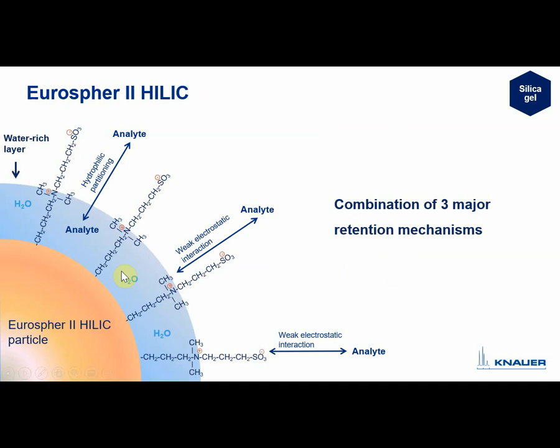Here you have your water-rich layer, again on the Eurosphere 2 HILIC particle. But as you have these chains with different charges, you have not only the hydrophilic partitioning of the analyte, but you also have weak electrostatic interactions with the charged groups here and here. So you have a combination of retention mechanisms. This is really interesting. And for some molecules, ionic molecules, it's really interesting to use such a particle, because you have even better retention than in the classical HILIC mode on a bare silica gel particle.